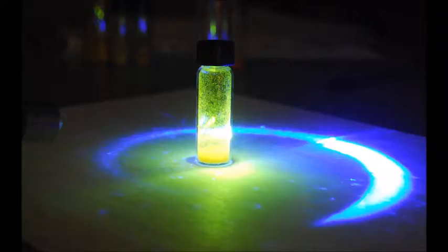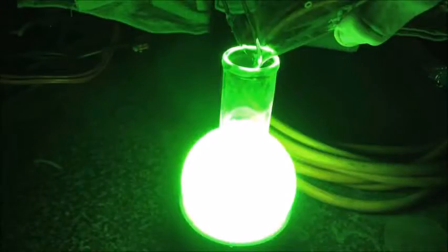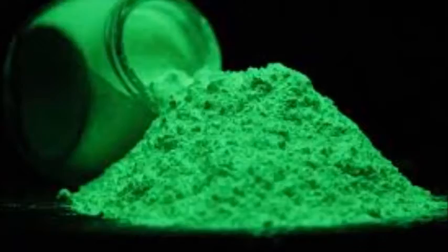There are 3 main types of luminescence, being fluorescence, phosphorescence, and chemiluminescence. Luminescence relies on a detector to quantify the emission of light from the sample. For the sample being analyzed to be quantified, it must be in a state easily detectable. For this, it is common for an analyte to be immobilized to a suitable support solid. This gives rise to 2 main types of analysis: solid phase luminescence, SPL, and support matrix luminescence, SML. Light emission comes from either the analyte itself or by an immobilized indicator interacting with the analyte.